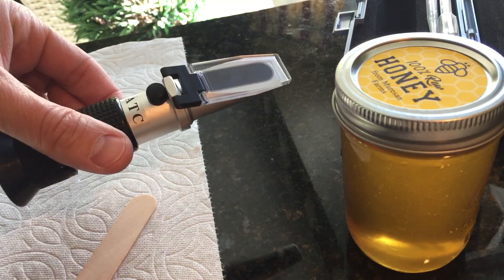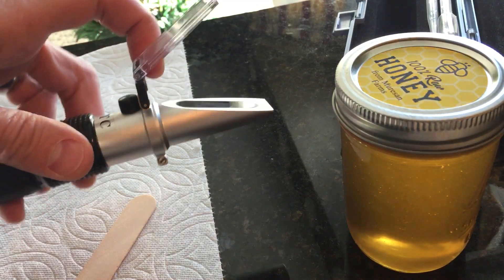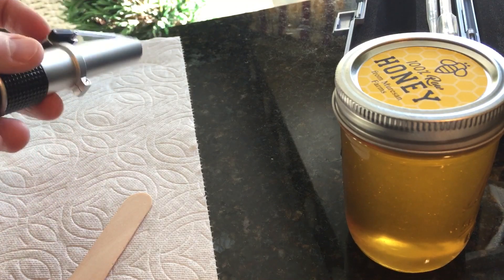If anyone's interested in how we do that, this is a refractometer. Put a little honey on the slide here, and then we'll check the moisture content.